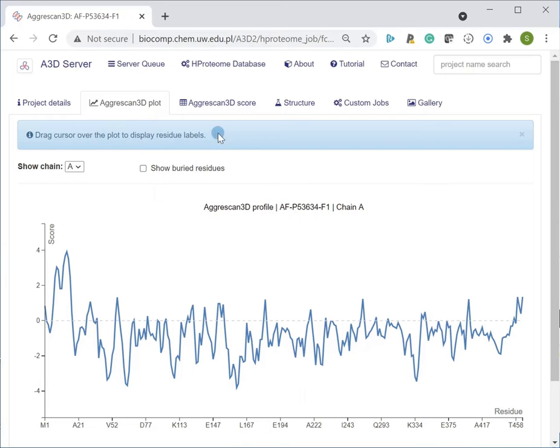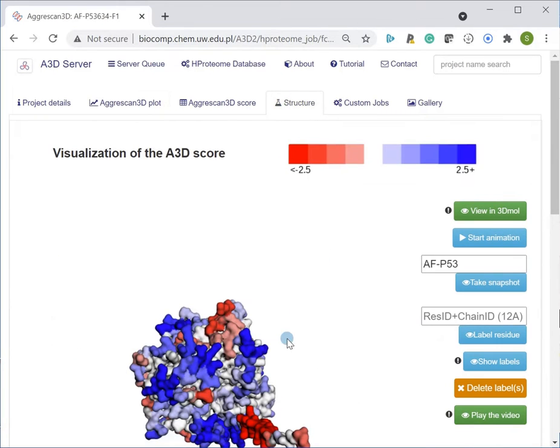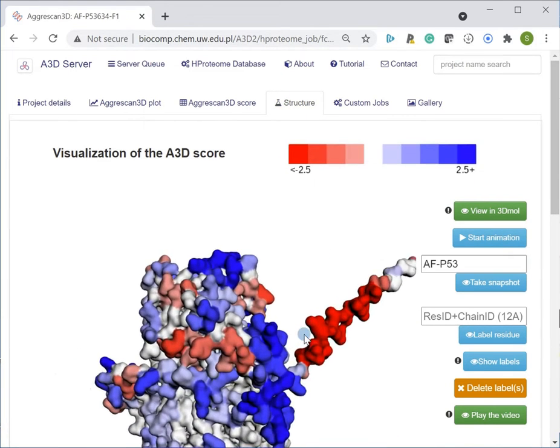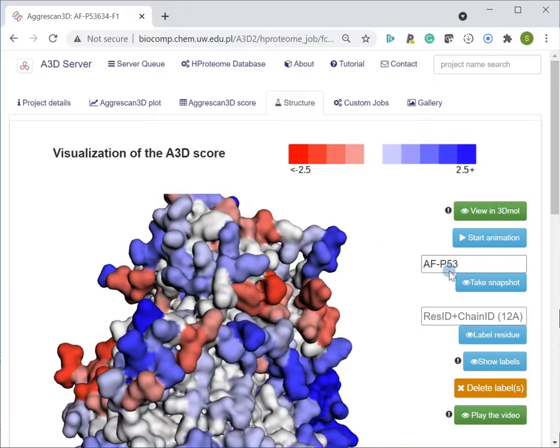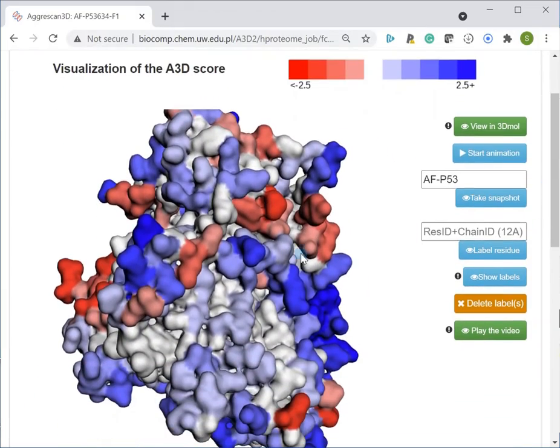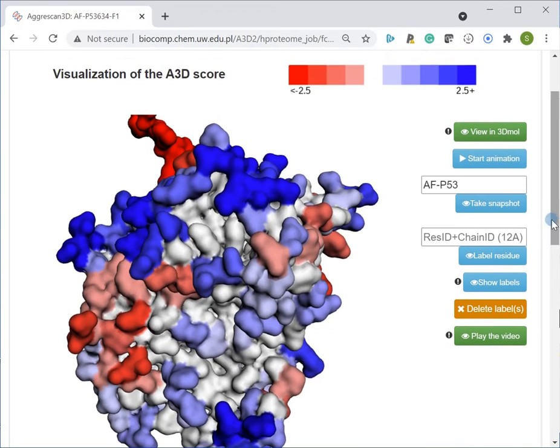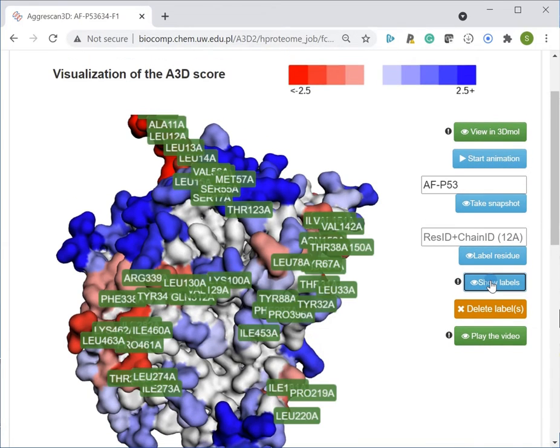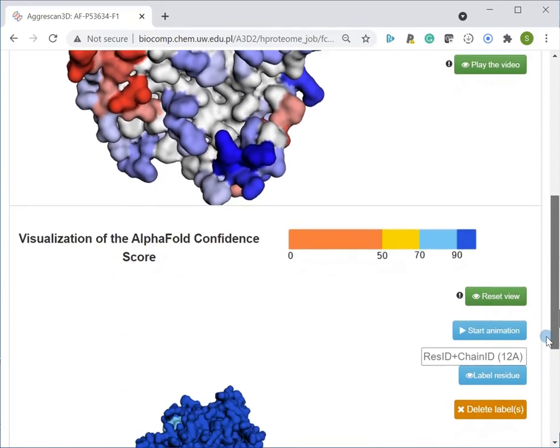On the structure page, protein structures can be visualized and analyzed interactively. Two visualizations are presented. The top visualization reports on the A3D score: dark blue color indicates highly soluble residues, while dark red indicates aggregation-prone regions. The bottom model depicts the AlphaFold confidence score.